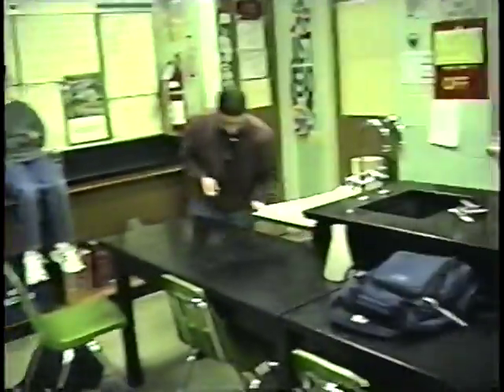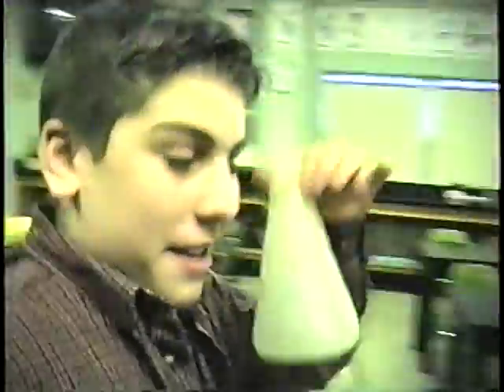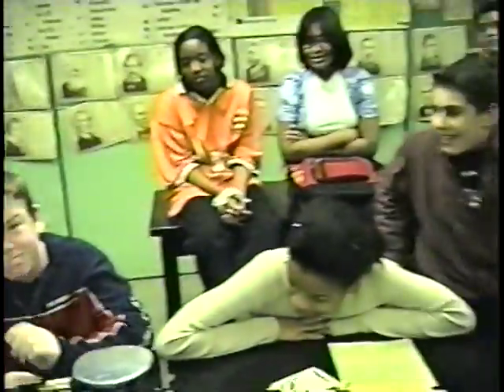Now, why does Phil have to dry off the metal? Yes. Water adds weight. So we want to get the weight just of the metal. Okay, now give it to Frankie. And what unit is the scale going to measure? Grams. So Frankie, if you would weigh it up for us.